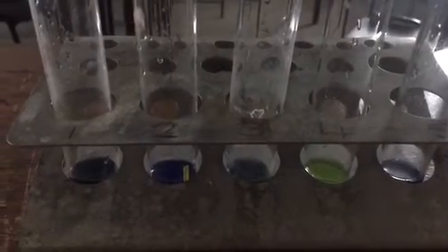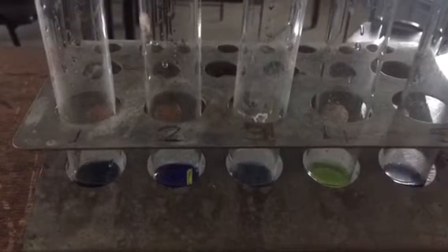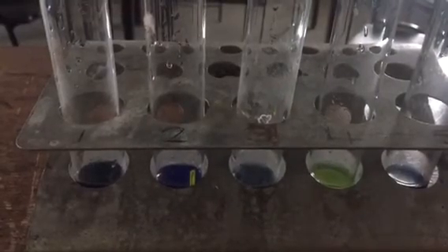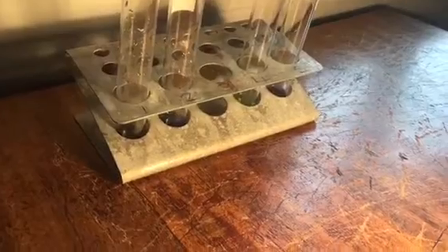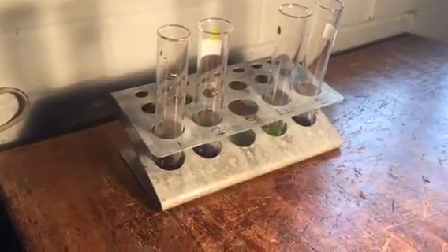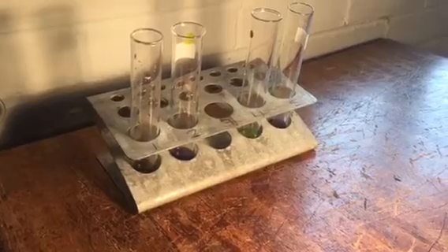We are expecting that tube one will change to colourless and go the same colour as tube four, and that tube three will stay blue the same as tube two. We now place them under a strong 100 watt light bulb and leave for ten minutes, with tube three taken out and placed into a dark space, or you can just wrap it in silver foil instead.